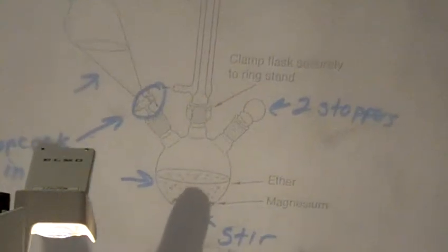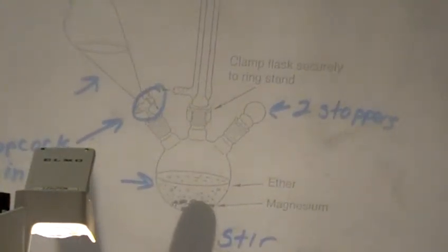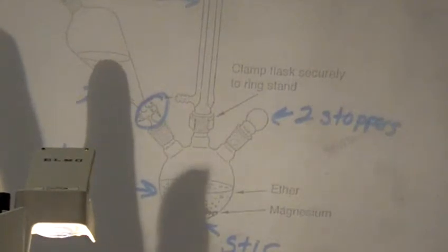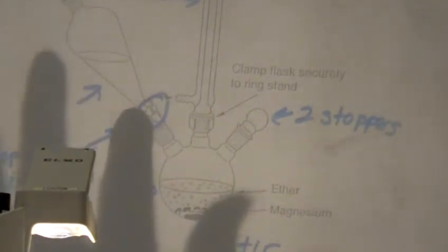So at this point, before you do any adding of this solution to this solution, or this solution to this mixture, you're going to have your apparatus checked, okay? So when you have magnesium and 10 mils of ether in your round bottom, you have your 40 mils of ether and your alkyl bromide in your sep funnel, but don't add anything yet, you're going to have your apparatus checked, okay?